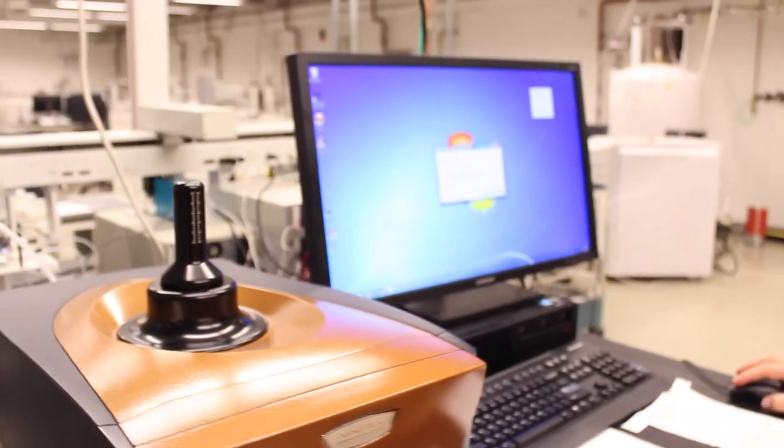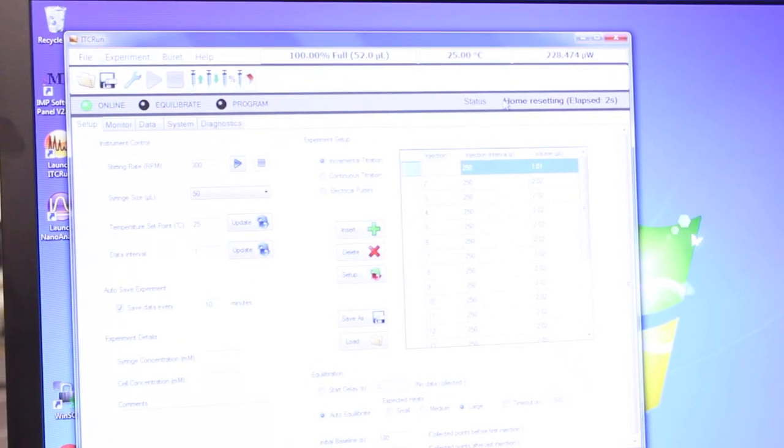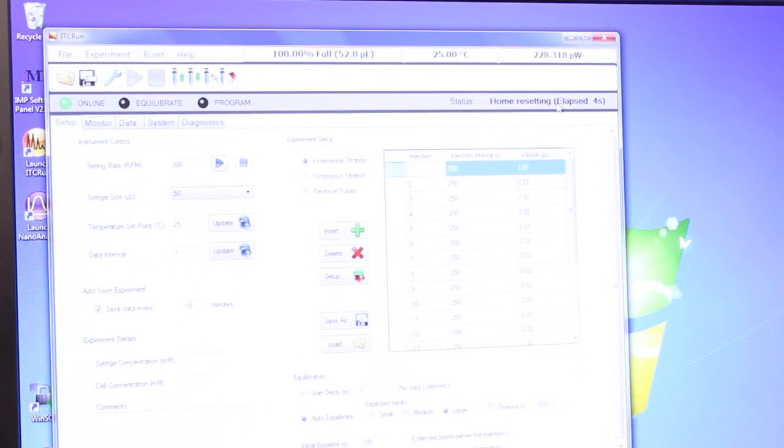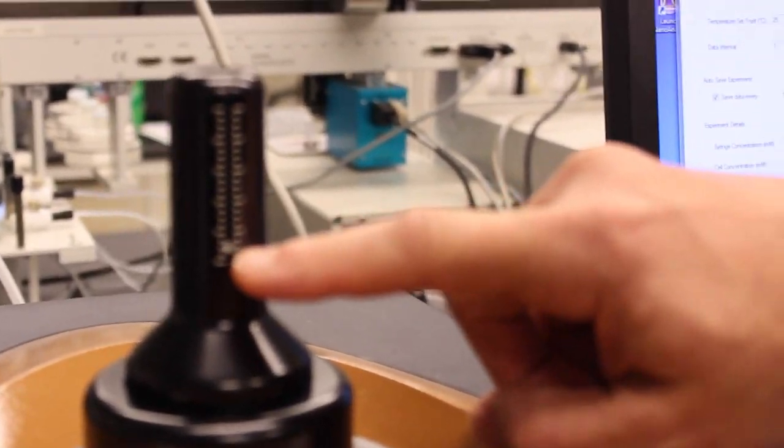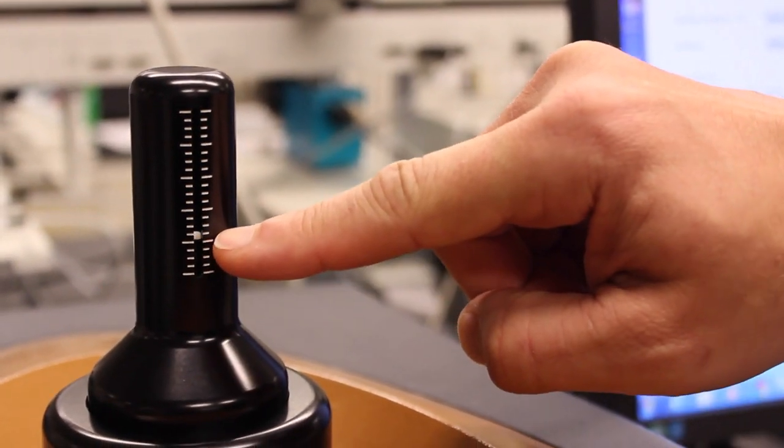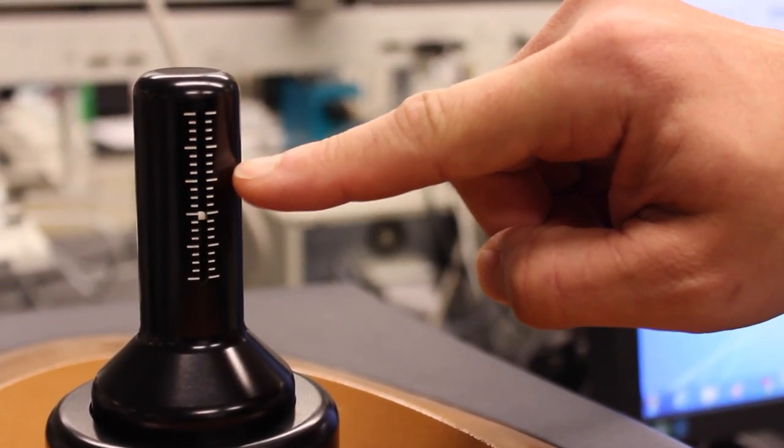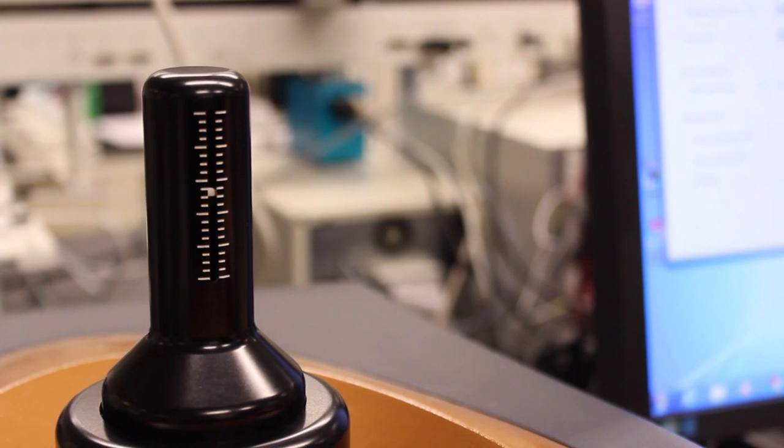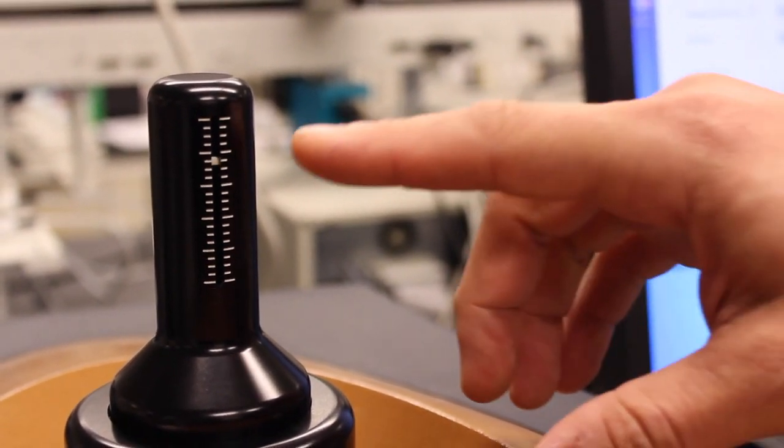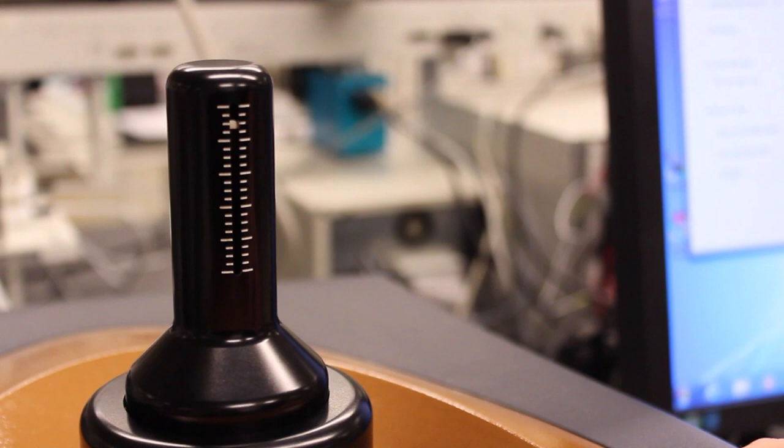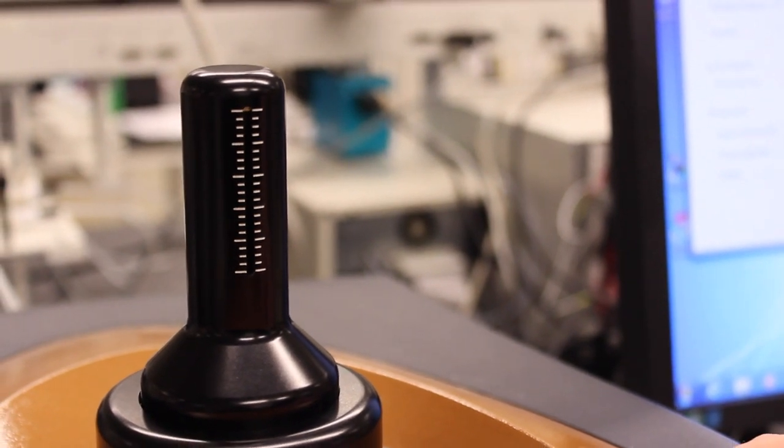Then we can press the OK button and the program will launch. It will say that it is home resetting. You can see the plunger here. It moves all the way down to the bottom and then back up to the top during the home reset procedure. This is so that the instrument can ensure that the plunger is in a known location when you start to set up your experiment.